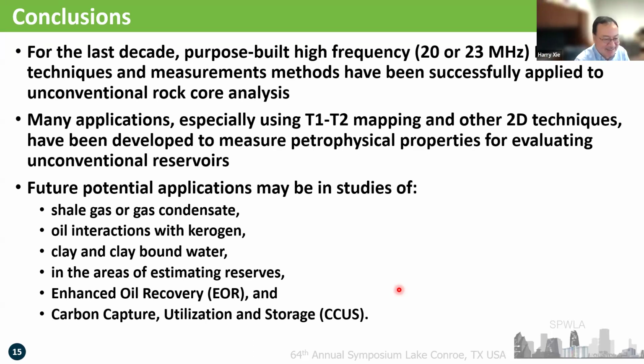Sure. So the first one: when we do the T2 inversion from the magnetization decay, generally our assumption has been that they are exponential, and that's how we do the inversion. I'm talking about traditional 2 megahertz magnetization decay. You showed a slide where you are taking a Gaussian and then two exponential components. Is there a reason that the very initial T2 times would be Gaussian, like in this high frequency NMR?